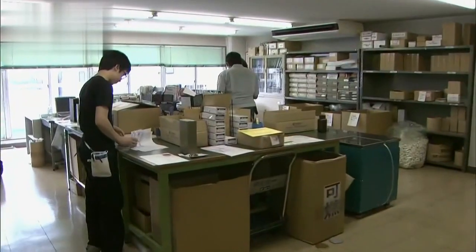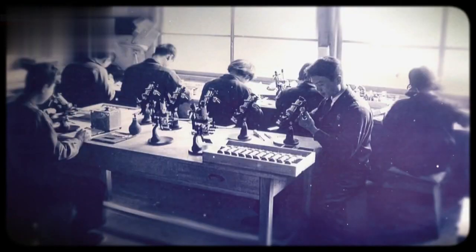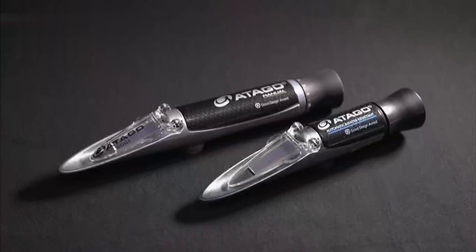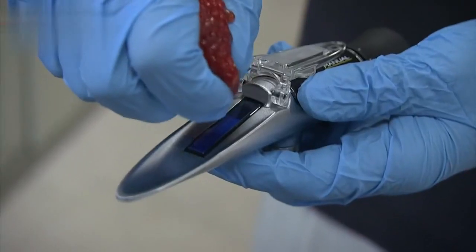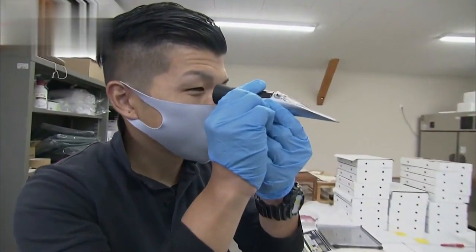The company is now recognized around the world for the refractometers. Their breakout product was released in 1953. Large desktop refractometers had been invented in Germany. The company succeeded in making a portable version. Their device proved popular with farmers all over. Sugar content is simply read off a scale, and testing could now be done in the field, too.